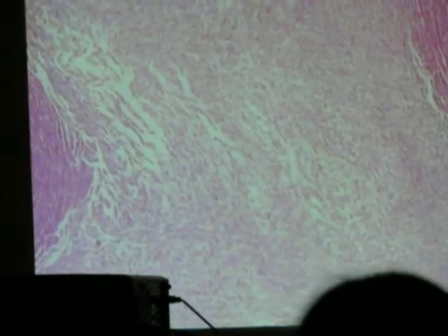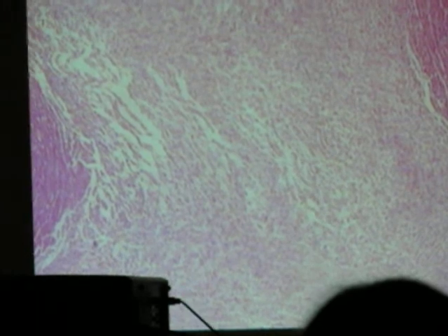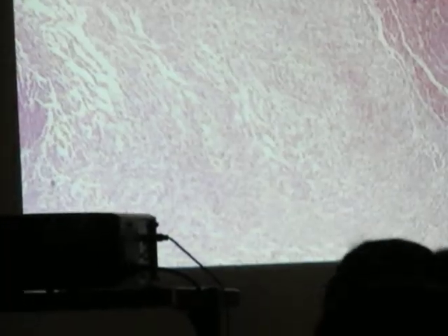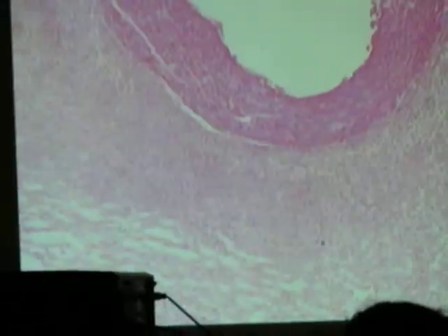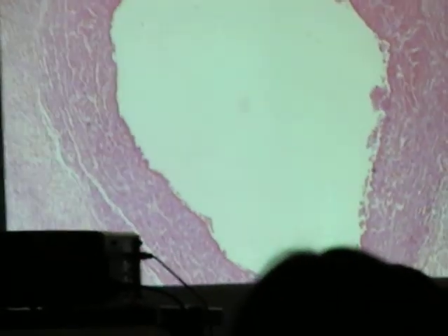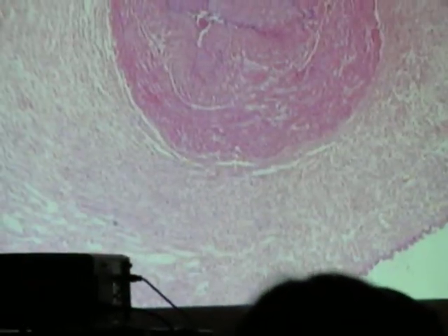And in my scope, I can see both the vein and the artery at the same time. I know you can't see it on the screen, but I can see that because I've got more of a picture on either side of that. So when we ask it on the scope, we'll be able to get an artery versus the vein, so you can tell the difference between them. So that's the vein. Larger, more expanded, and then compact, smaller, the artery.